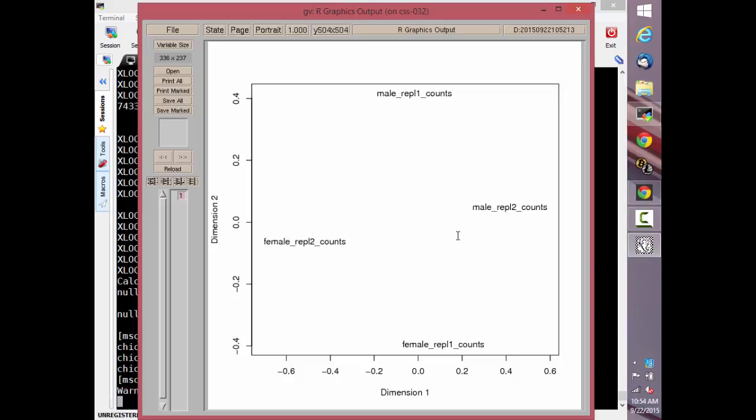Blastocysts, samples from individual growing embryonic chickens. So female replicate one and male replicate one are on the same batch? Or what's the experiment design? That's the question. No, these should all be individual samples. Okay. So is there a possibility of batch effect here?